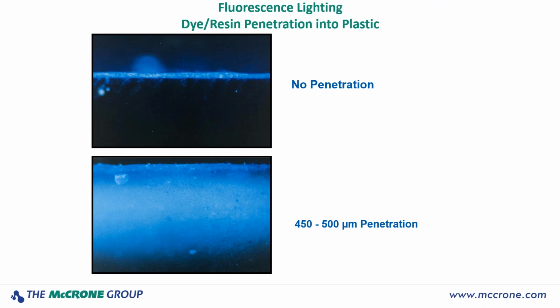They did a study of bake temperature and time of the adhesion promoter on the plastic to determine the different depths that they were getting. And we could easily give them that information very quickly. They finally decided that the 450 to 500 micrometer penetration depth was about optimized for their adhesion. A lot of this information and work was published by Ford Motor Company.